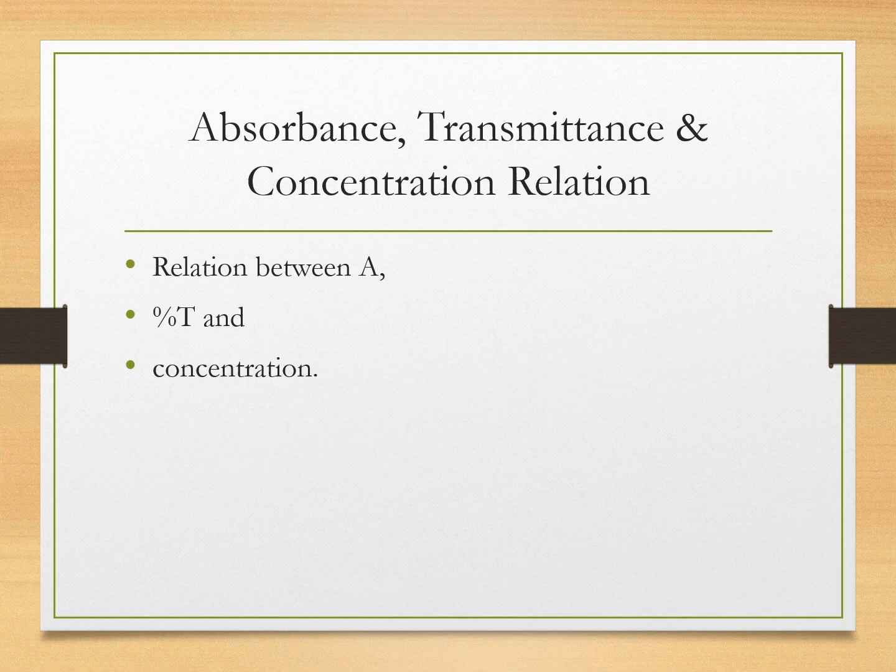Absorbance is also related to the transmittance. Higher concentration results in higher absorbance. This relationship is used for calibration curves and concentration calculations.